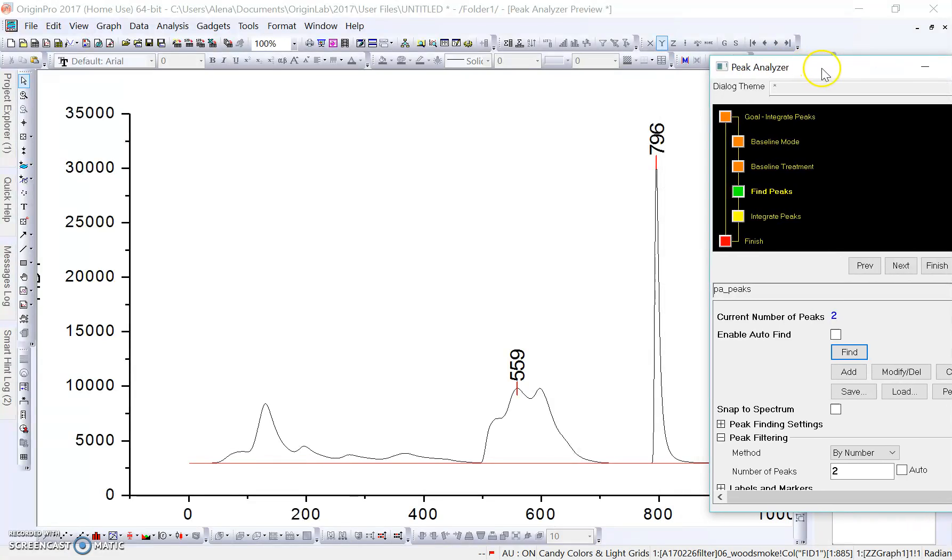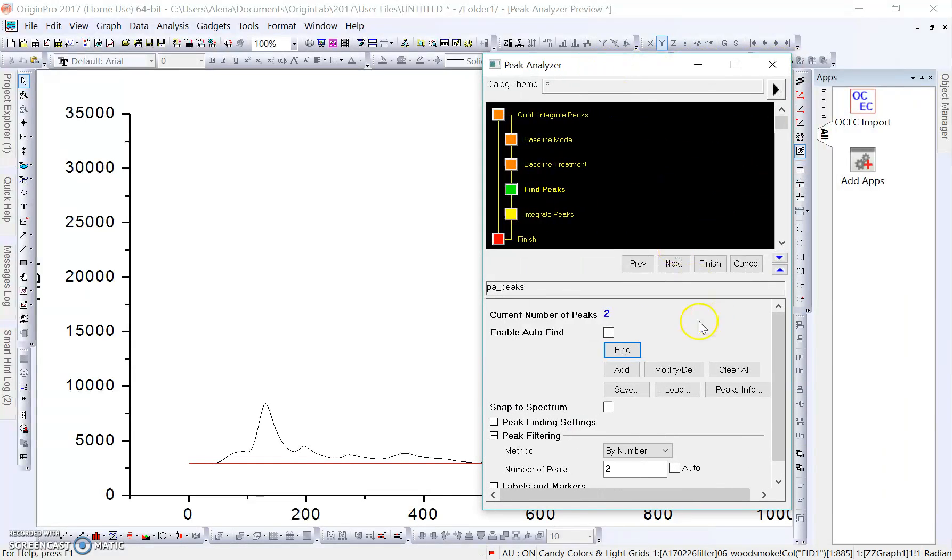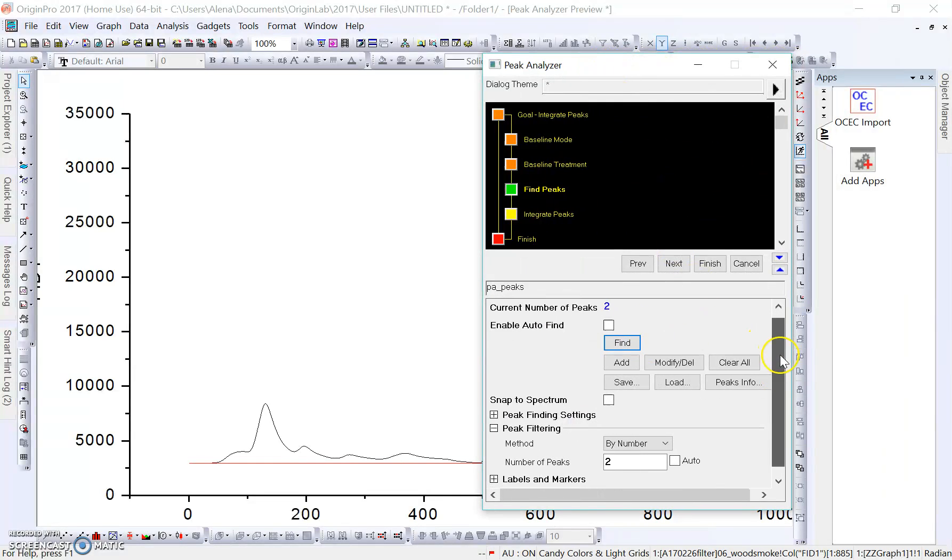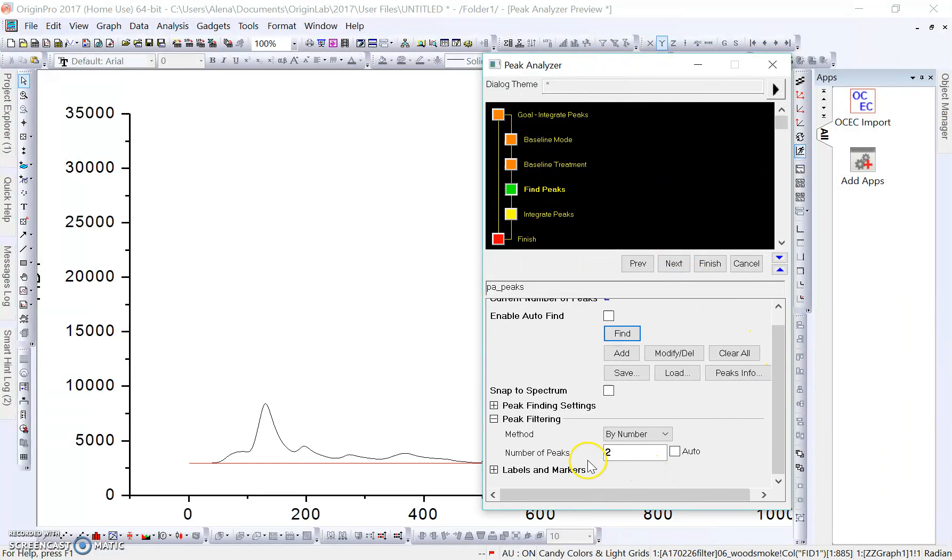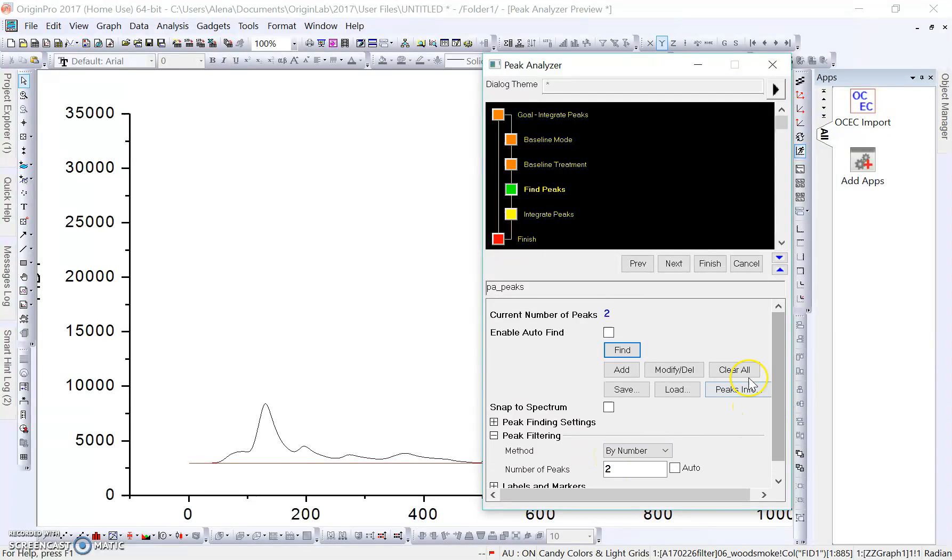If I move this out of the way, we can see that it found the two highest peaks here, which is our calibration peak height and another area right in here in our elemental carbon fraction. That's all we need to worry about in this case. We just want number of peaks two because we're only going to integrate two areas. I'm going to click Next.